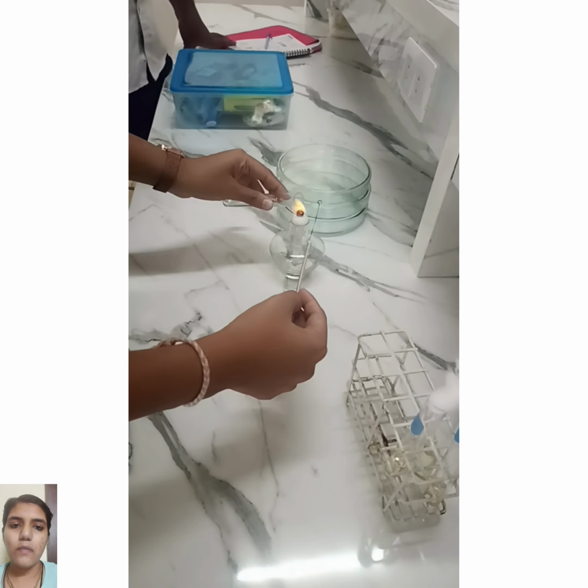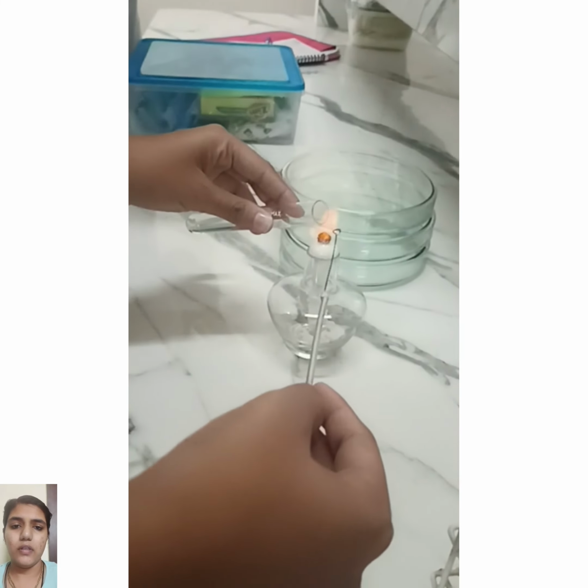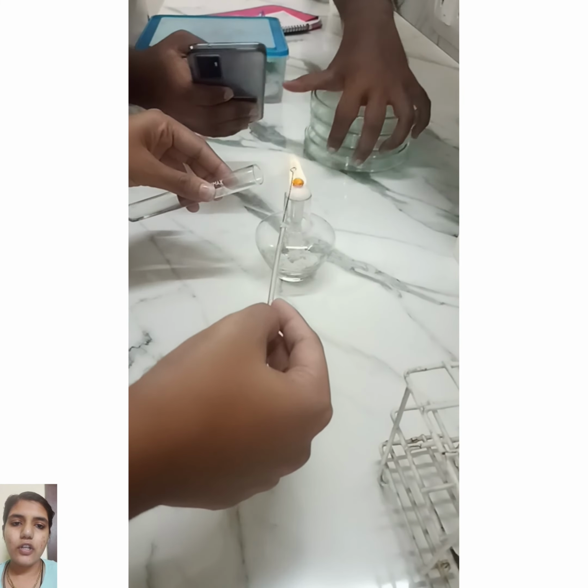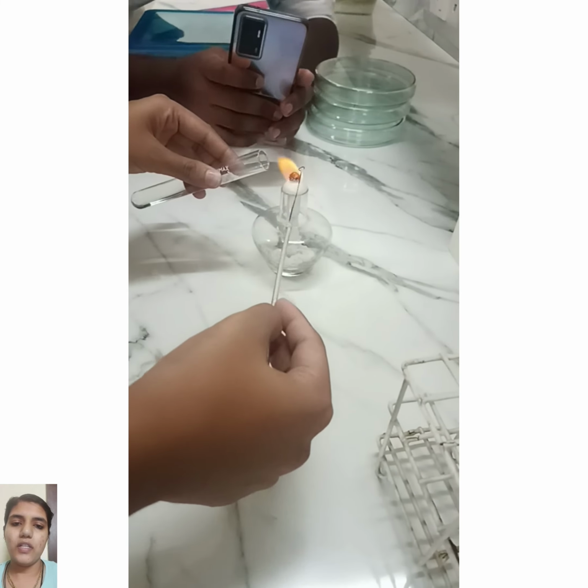tube mouth that contains contaminated water and put the loop inside it after sterilizing it, and then again heat the test tube mouth in order to avoid any contamination. Then we need to take up the test tube containing nutrient broth of one type, remove the cap and flame the mouth of it, and avoid putting the cap of the test tube on the table. Hold it in the same hand as the inoculating loop to avoid unwanted bacteria.